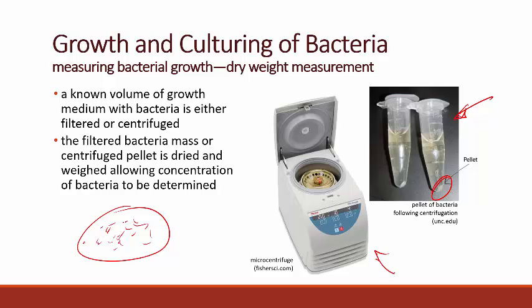Okay, so lots of ways, but again, they are all estimates. They're not 100% accurate, but they will get you close enough to being able to estimate the number of bacteria that are found in your culture.